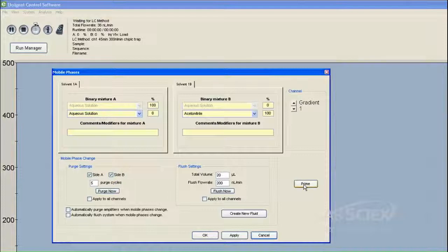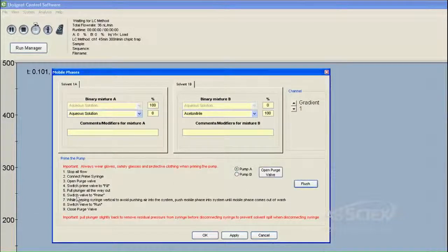Click Prime. Follow the on-screen instructions. Select the pump side. Click the Open Purge Valve button.